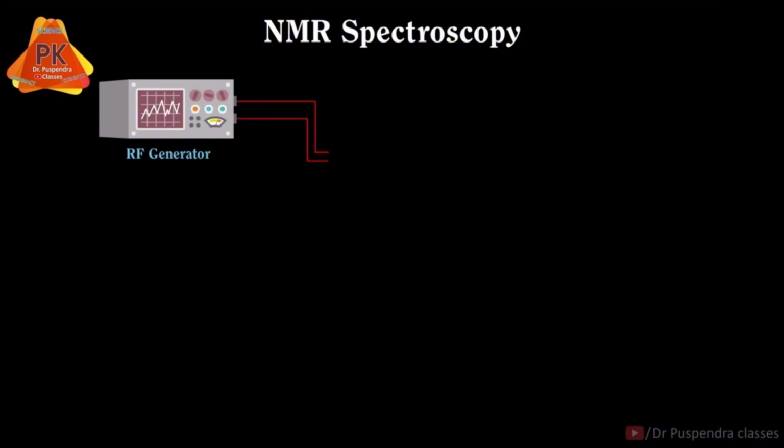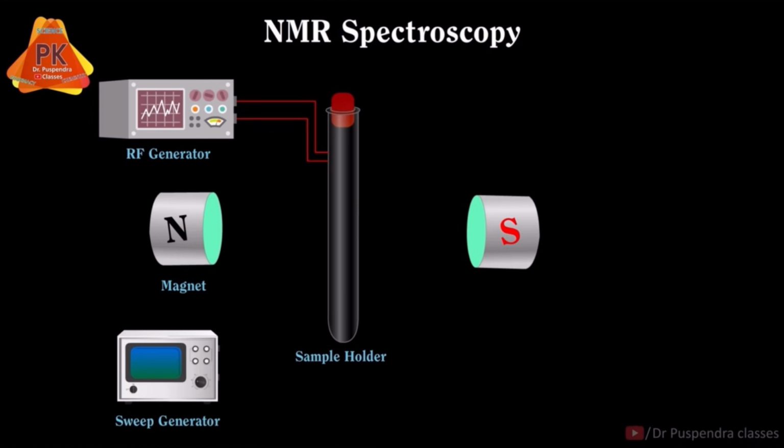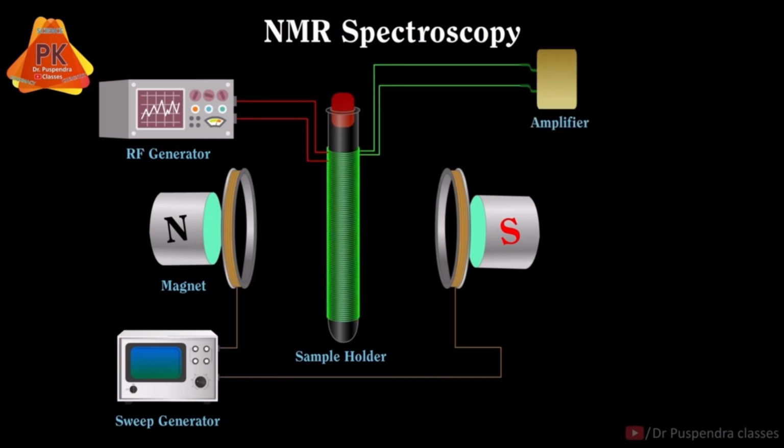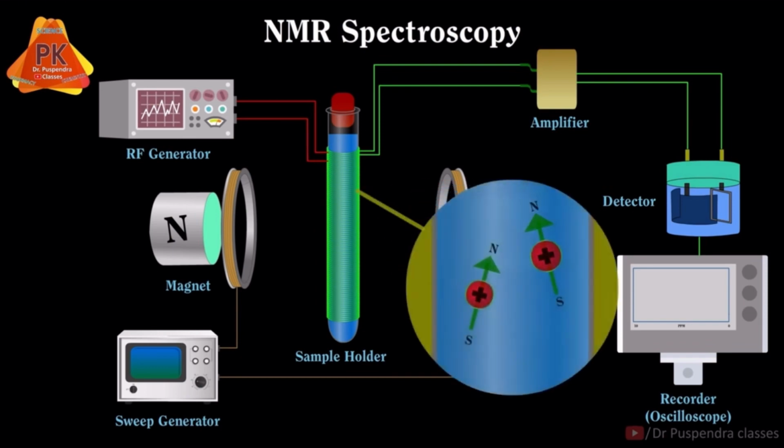However, there are a few major components that play a big role in NMR operation. First is the magnet, which generates a homogeneous strong magnetic field that emits electromagnetic radiation between 60 to 100 MHz. Second is the magnetic coil that generates a magnetic field when a current flows through it. And third is the radio frequency system that controls the nuclear spin and detects the signal.